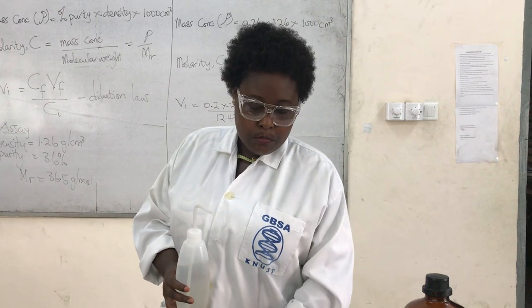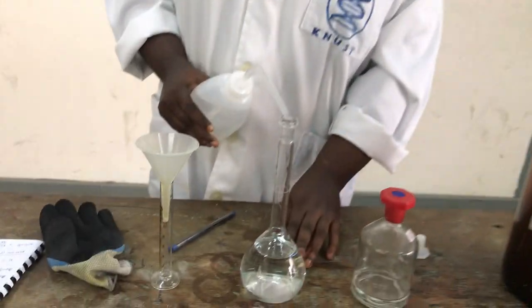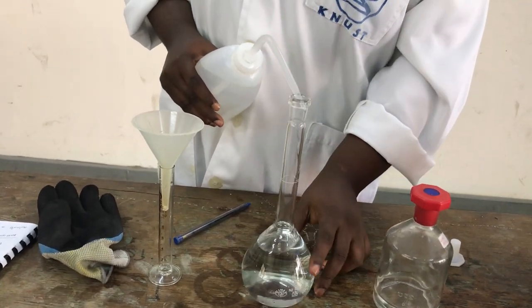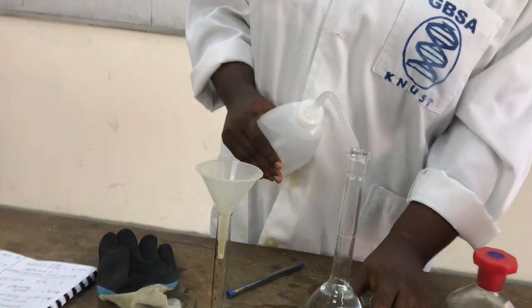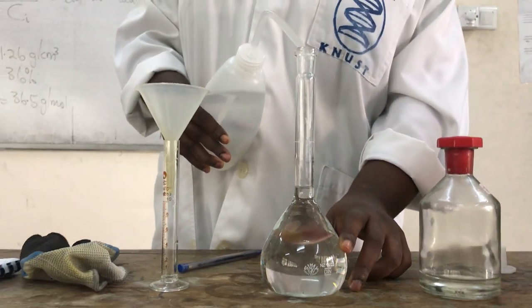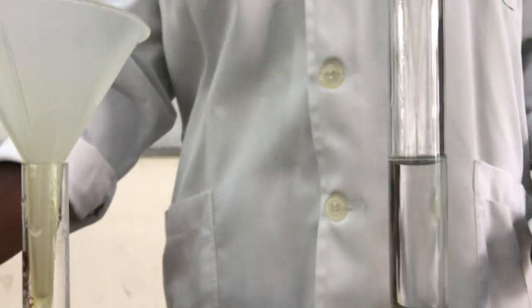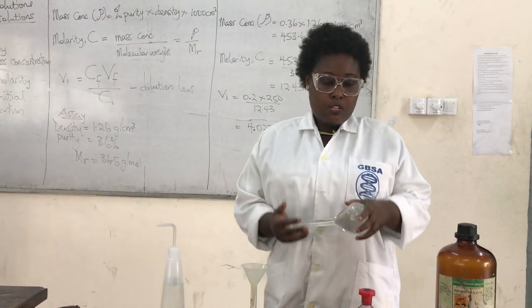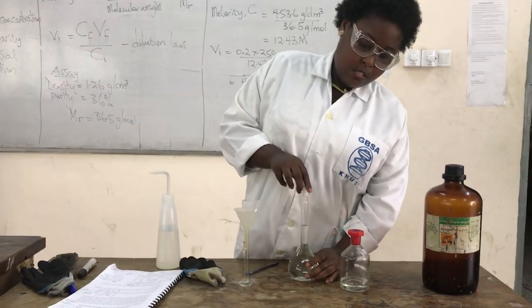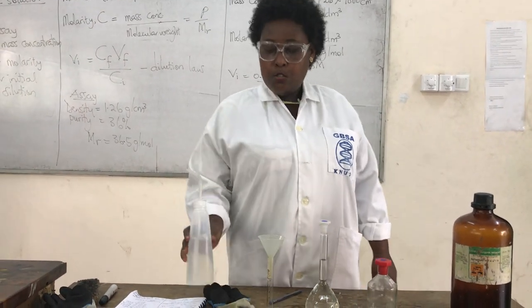Remove the funnel, then top up the solution to the meniscus at eye level. Gently top up, making sure it does not exceed the meniscus. Check that it is exactly on the meniscus, then cover the flask and gently shake to mix the solution.